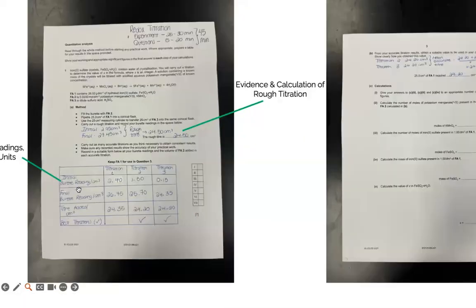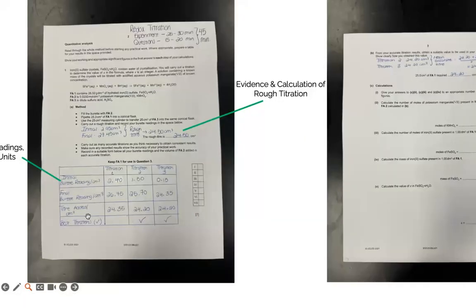For the table, 1 point comes from the headings and the units, so you must have these headings and you must have these units. You get another point for accurate burette readings to the 0.05 centimeter cubed. So if you end in a 1, 2, 3, 4, 6, 7, 8, 9, you will not get these points. You have to end your readings in 0 and 5 and have 2 decimal places.